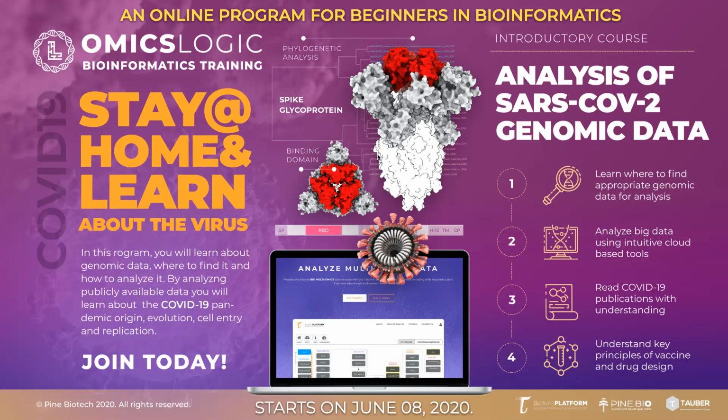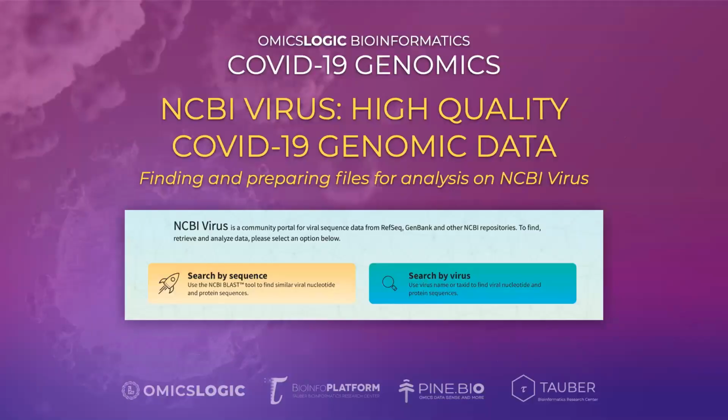So in today's session, as a hands-on review and preparation for adapting some of these principles that we've covered up until now to a project of your own, we're actually going to be looking at NCBI Virus, which is a database that we already started looking at, where we can search by virus and find a number of relevant coronavirus genomes.